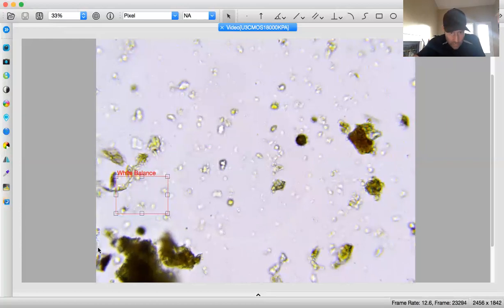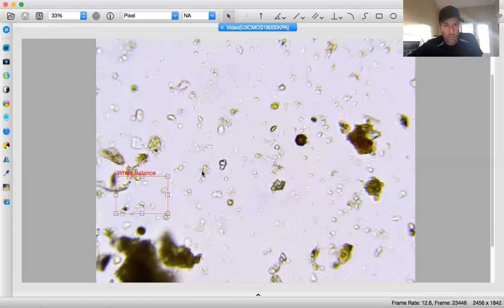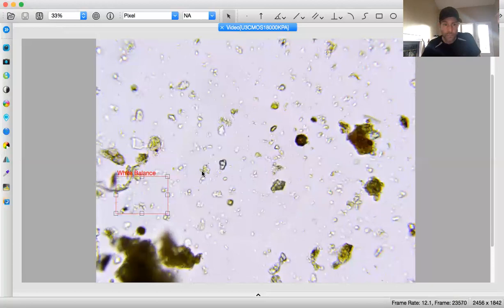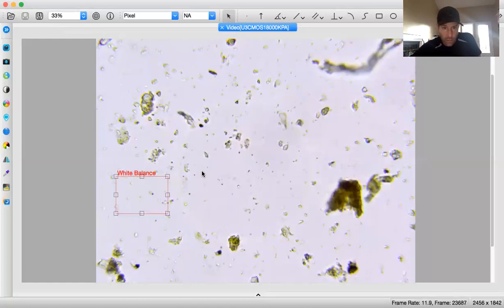Seeing there's some tapering. There might be a filament here, but it's tapered, so we're not going to count that. This is just a big mess. I'm seeing nothing else to record. I'll make sure I got my information for that one. Yes. So on that regard, we can move forward. I don't see anything else to record. Okay, so moving on here, this is field of view 4 and reading area 1.